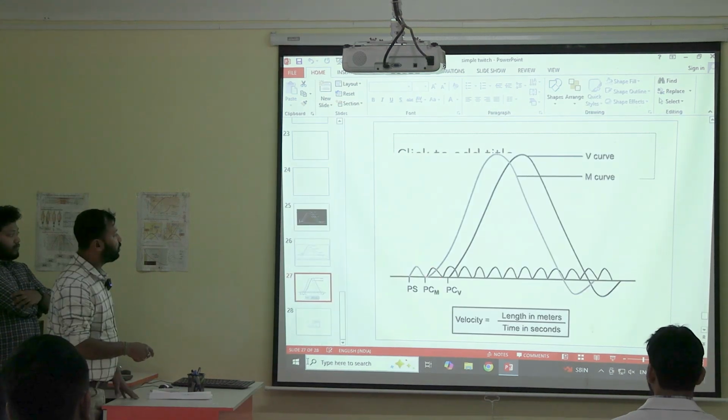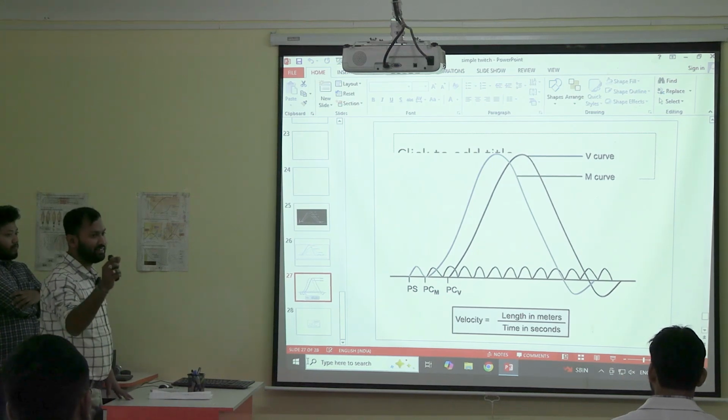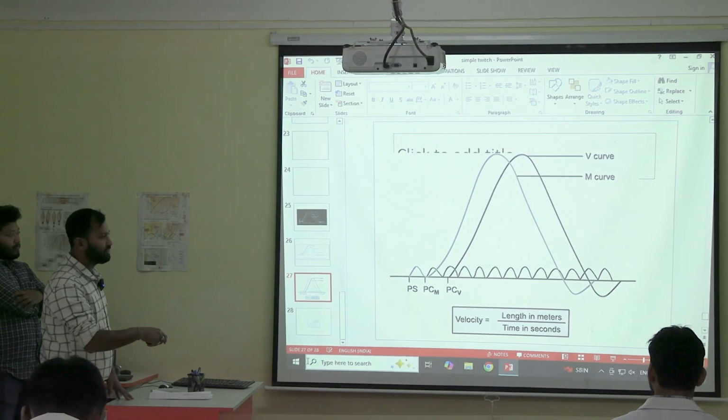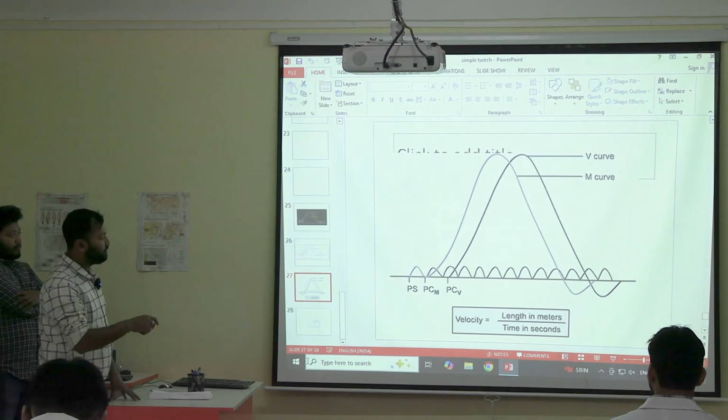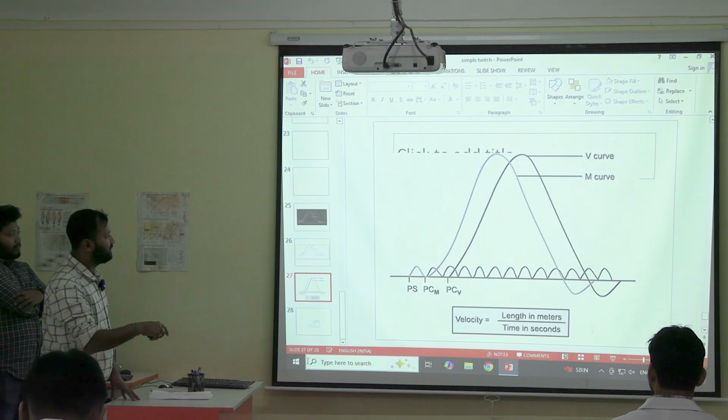Here it is written as M, and here as V. V is the vertebral end, where the vertebra is connected to the nerve, and this one is the muscular end, meaning near the muscle. If you give the stimulus near the muscle, the response will be faster. The latent period, you can see here is the stimulus and here is the response, is less. But in the case of the vertebral end, the latent period is more.